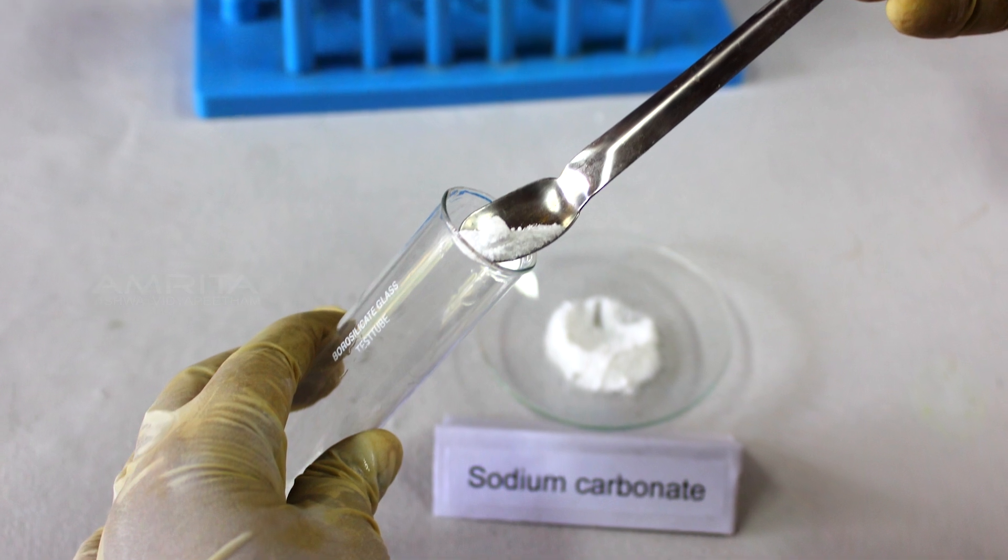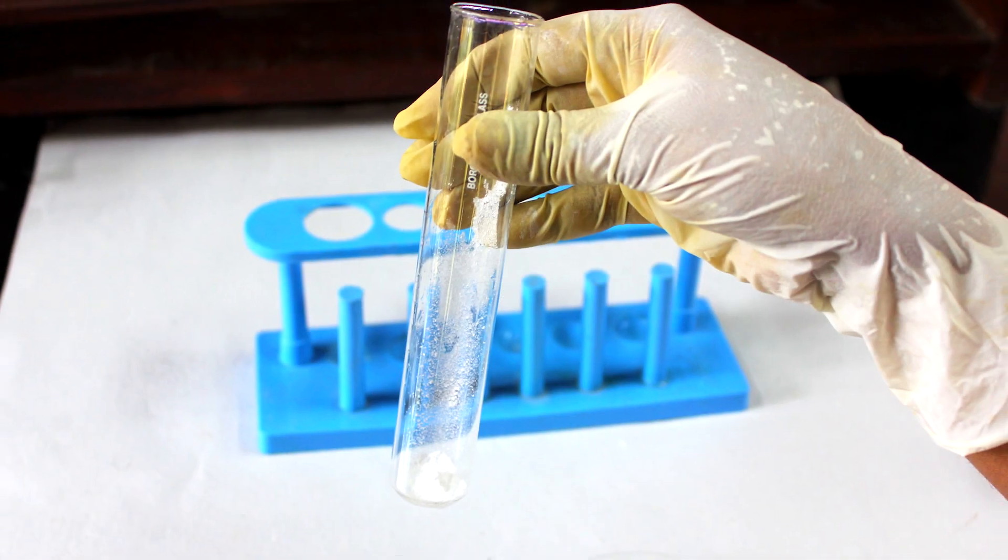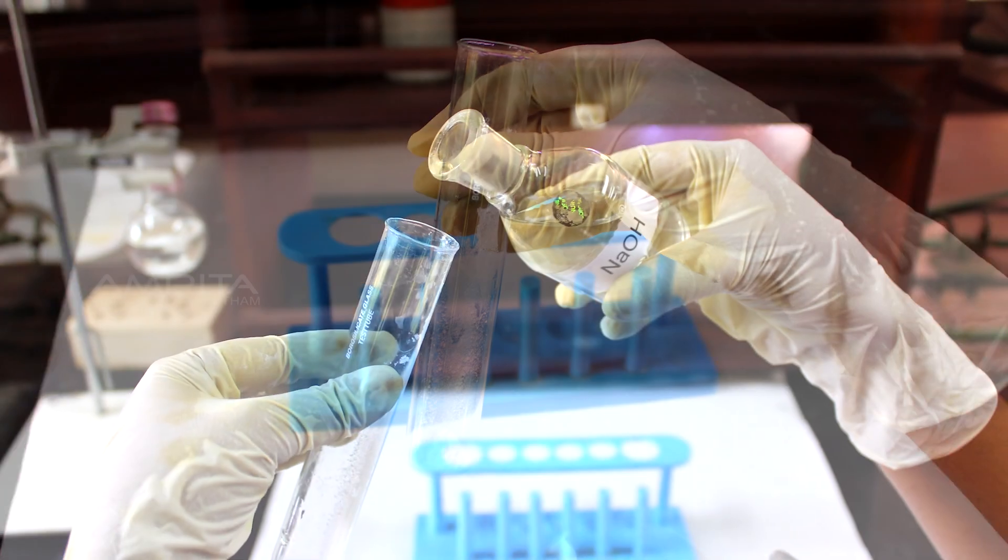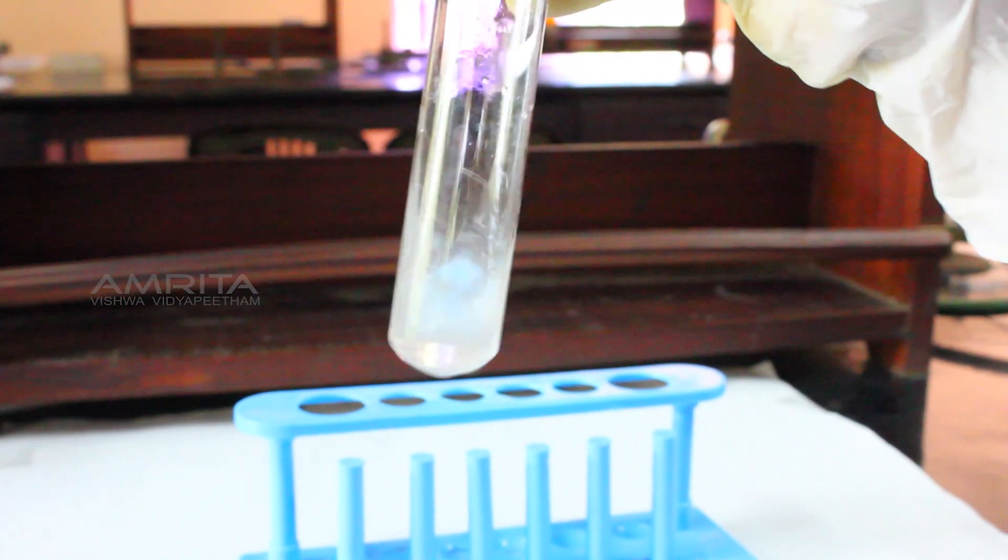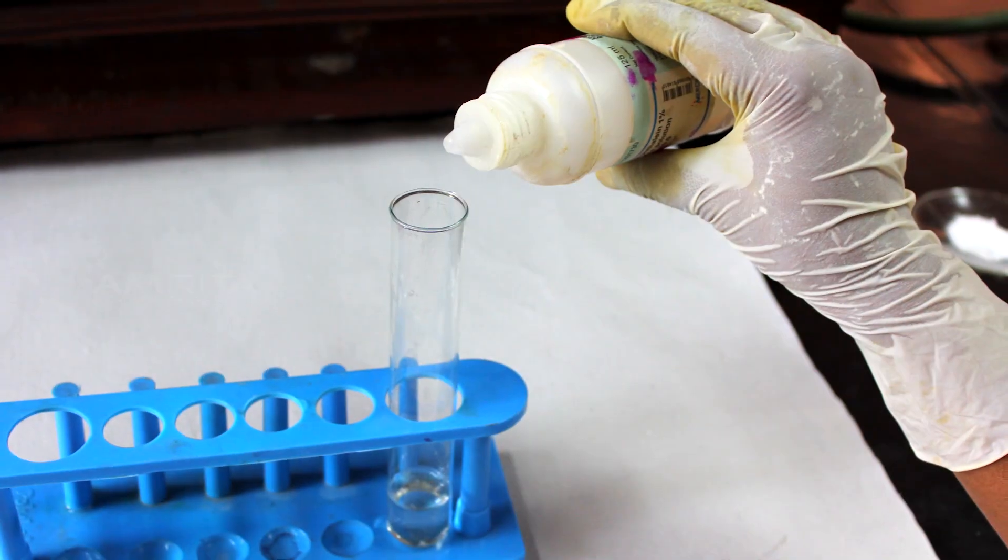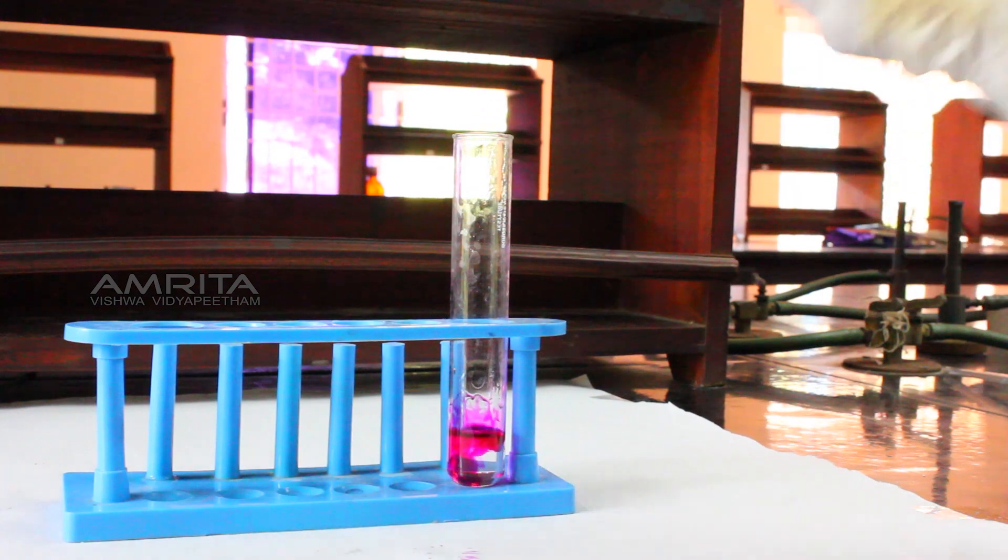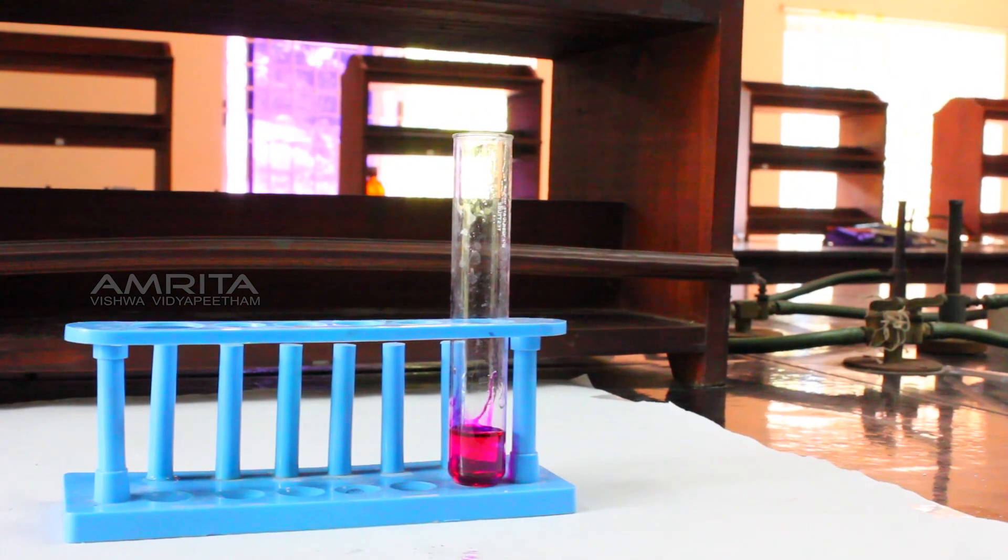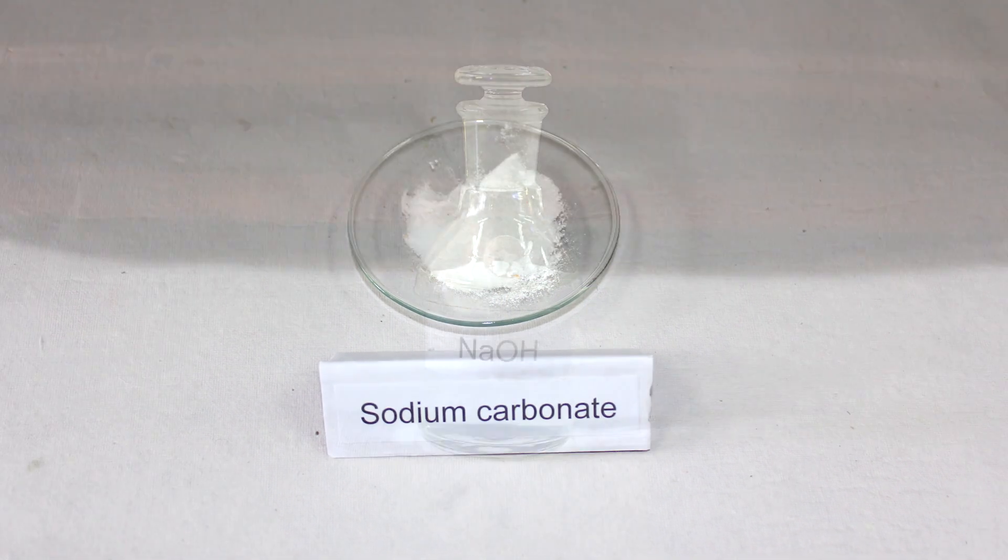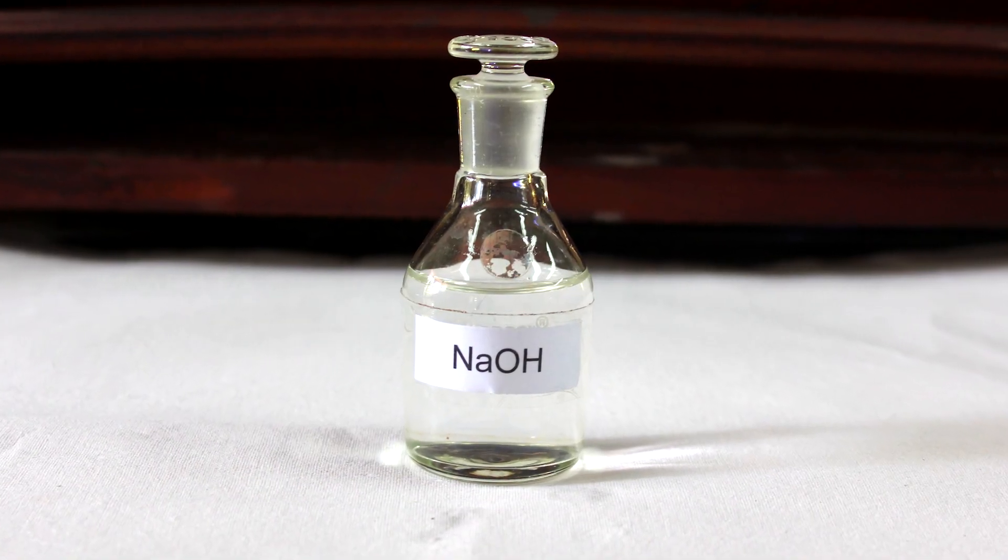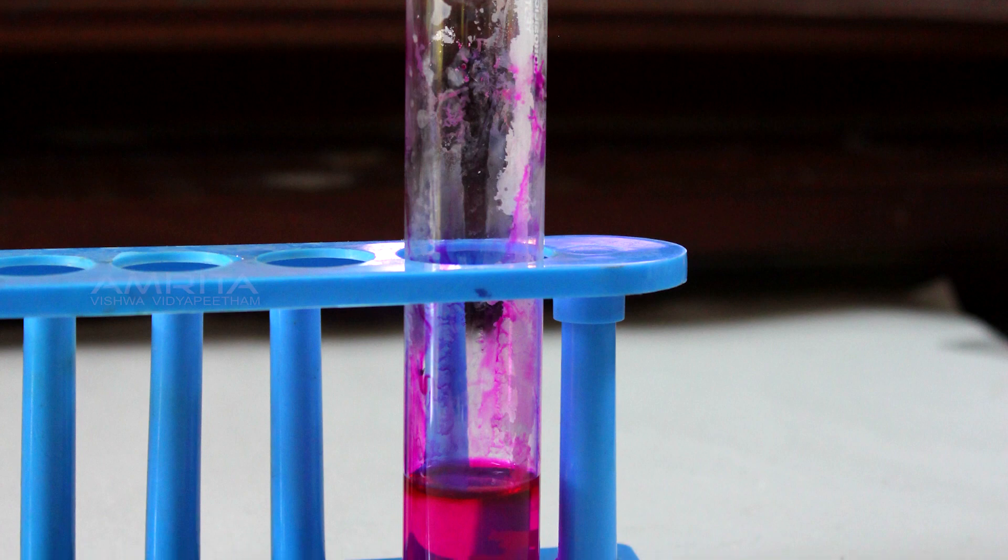Now, add a small amount of sodium carbonate in a boiling tube and add NaOH solution into it. Then shake the boiling tube well. Add a few drops of phenolphthalein into it. You can observe that the color of this solution turns pink, which indicates that both sodium carbonate and NaOH do not react but form an alkaline solution.